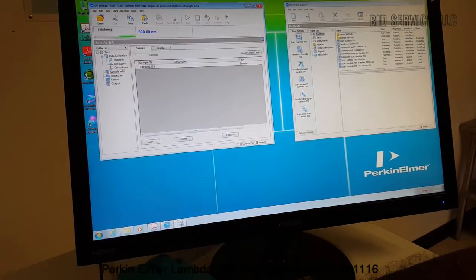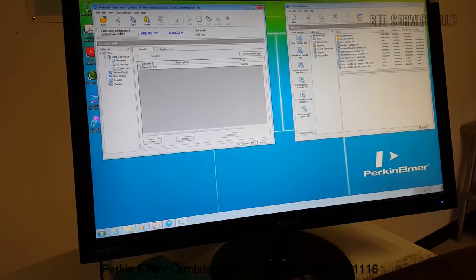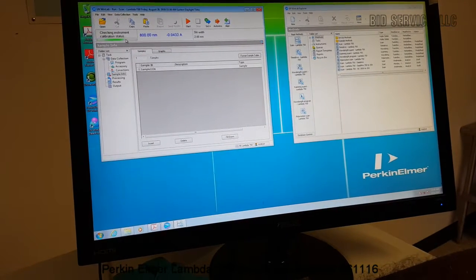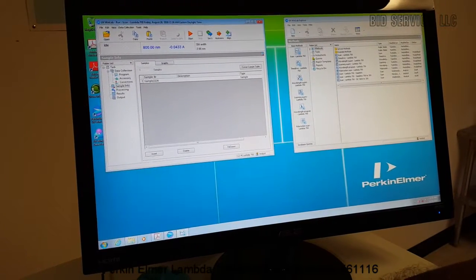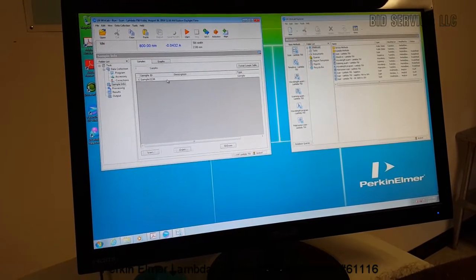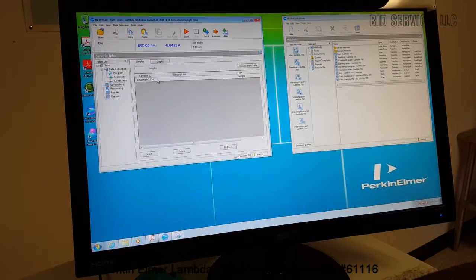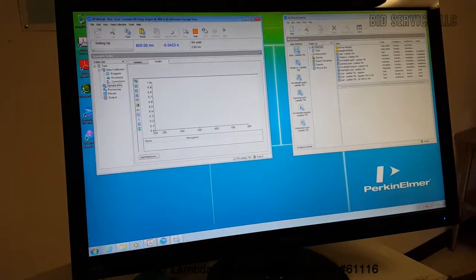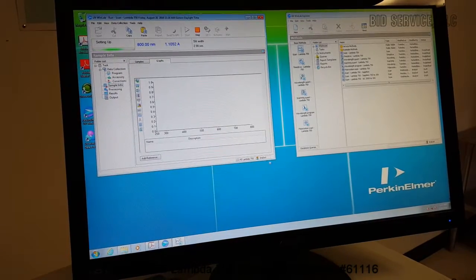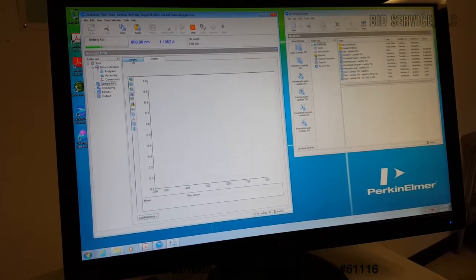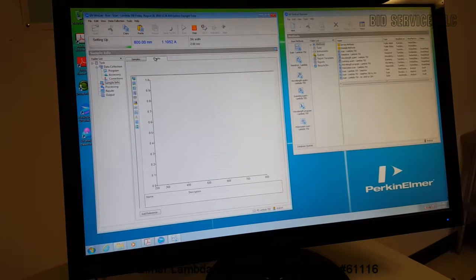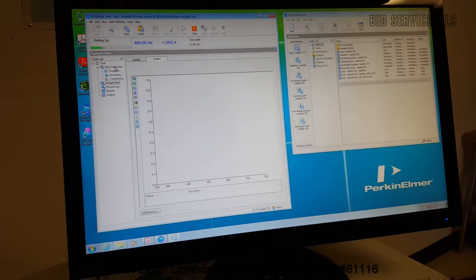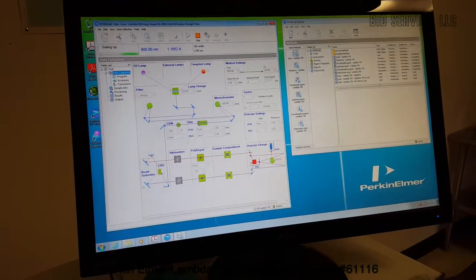So once the scan window is selected, the initialization of the spectrometer takes place and the unit will also check the instrument calibration. And the sample ID, there is a default counter which will always be a new sample ID. And once you press Start, the graph window will open. And the unit will start to set up the machine to the settings as set in the data collection window.